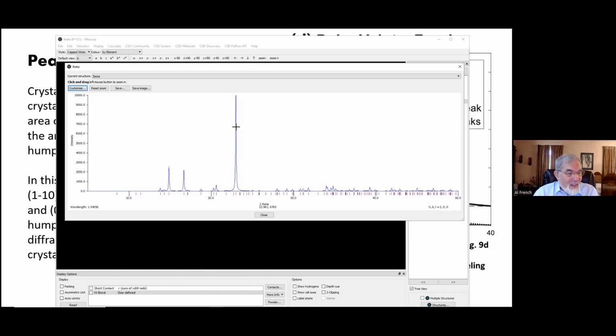That's a different convention. It's not wrong, but most of the polymer scientists use the convention that we're using here, and it's tied to the conventions that are in the crystal structure papers that we took these structures from. Another thing I'd like to point out is this peak right here. I believe that's it. Yes. You see the label in the lower right corner for this insignificant little peak. That's the 004. And you see that it's in a cluster of peaks here.